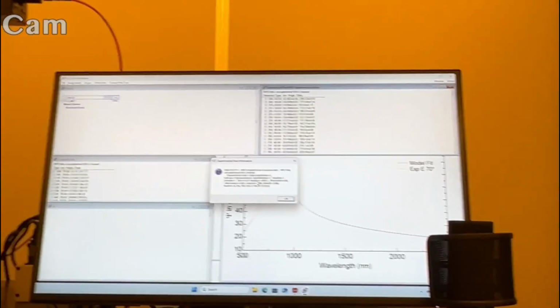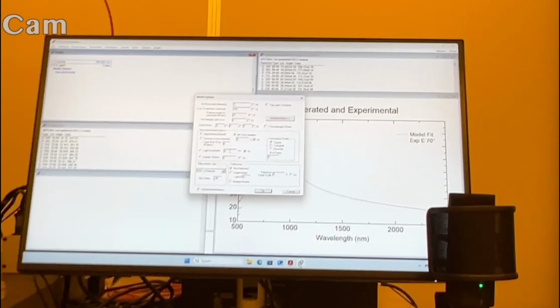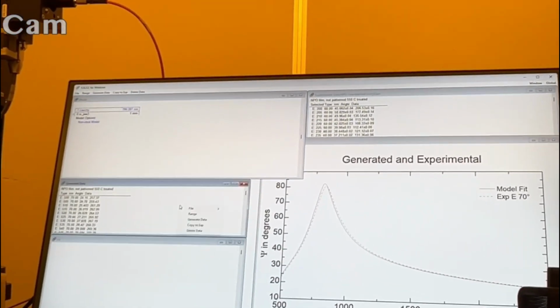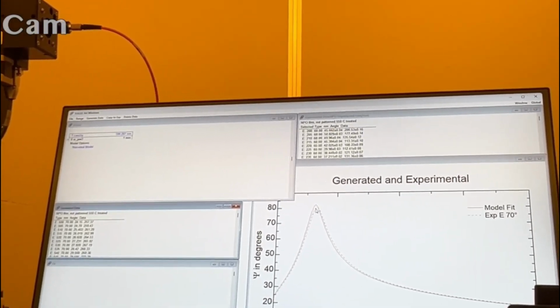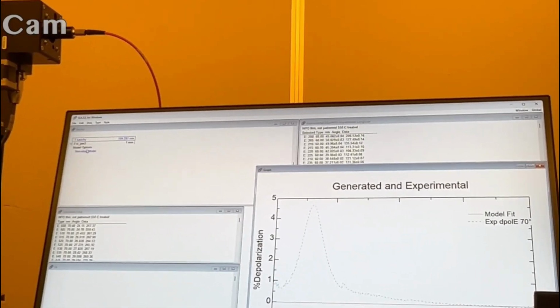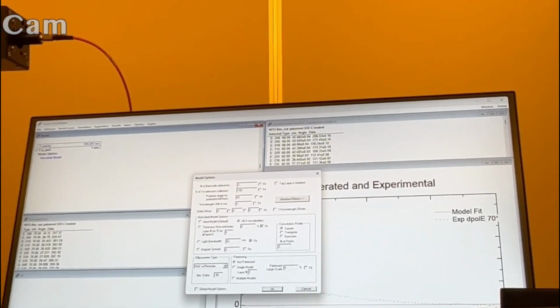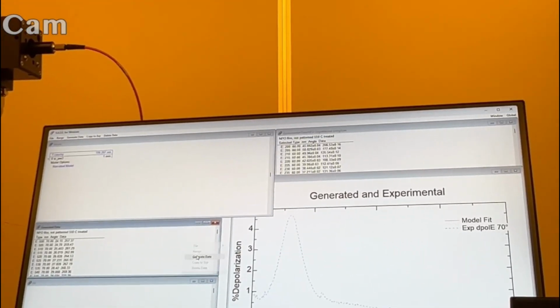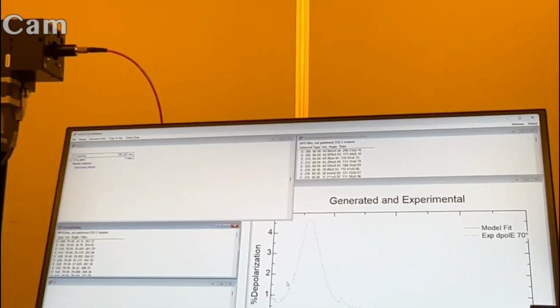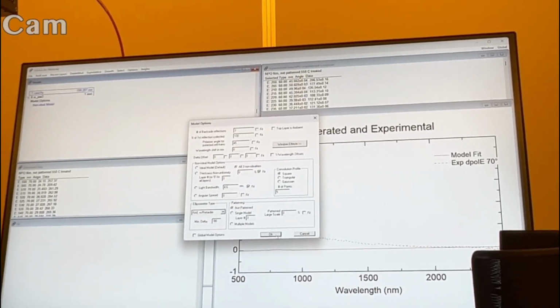So if I wanted to simulate that just for fun, let's say we had 2.3-ish, 2.4 bandwidth, and I just generate that. Okay, it didn't really influence that too much. And how much depolarization did it predict? Almost none. Even out here it's probably on the next grating, so it might be double that, but let's say we did have 4.6. I'm just simulating. Eventually there's a little bit of a bump here. Farther in the UV that would become more important. But you can see that you need a heck of a lot of bandwidth to describe that.